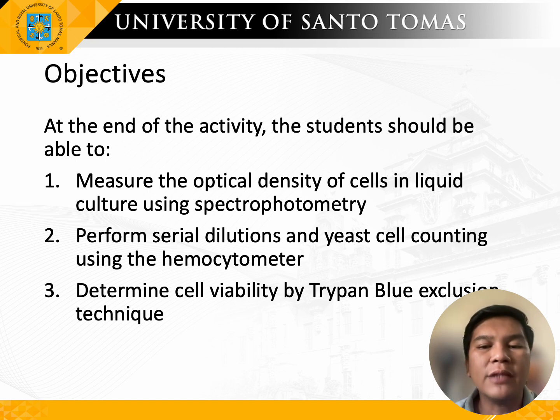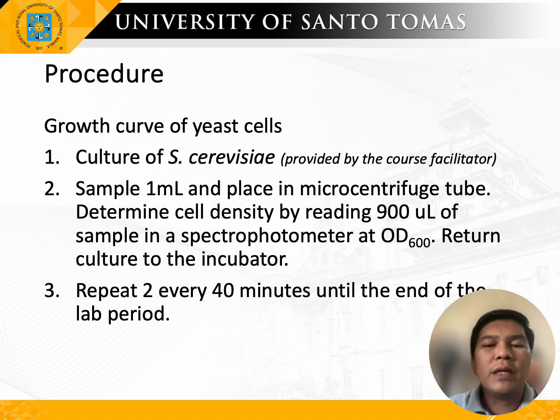Next, perform serial dilutions and yeast cell counting using the haemocytometer, and determine the cell viability by trypan blue exclusion technique.